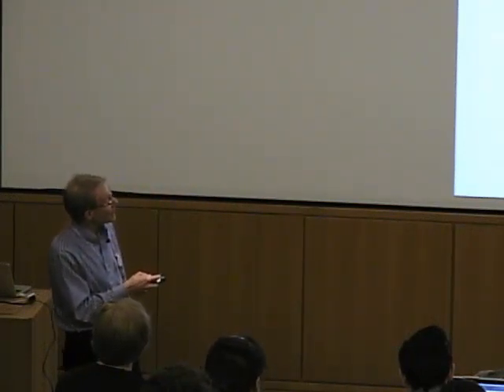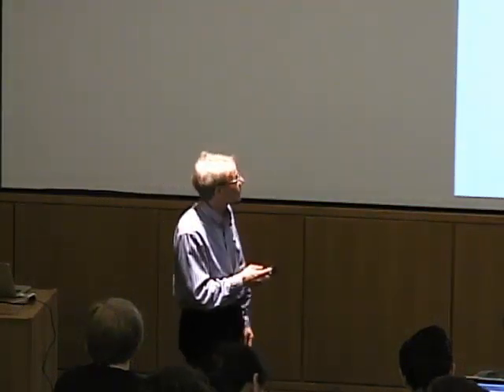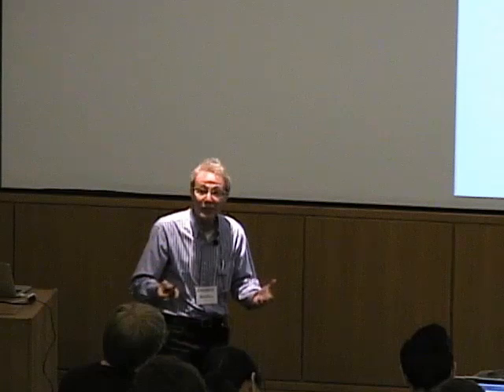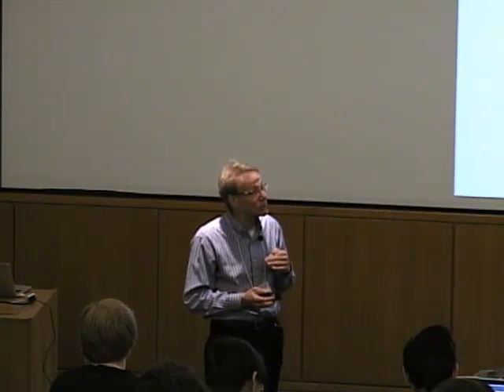So that's a number that tends to be softer. The binding enthalpy, remember, you're measuring the net heat flow, so a lot of things may contribute to that, and we'll talk about that a bit more. The binding constant, remember, you're measuring the overall equilibrium between the titrant and what's in the cell, and it's very useful to make sure you compare and confirm this with another method. Turns out ITC got a bad rap early on because people weren't being careful, and so the binding constants that were being reported from ITC didn't match those from equilibrium dialysis, and people said that technique sucks. And luckily, if you're careful, the method will, in fact, agree. So that's a very important confirmation.